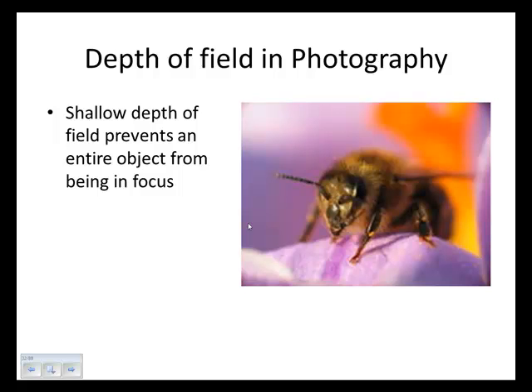Consider this little bee. Is he in focus? Yes or no? Both answers are correct, right? Part of his body is in focus, and part of his body is blurry, right? So, this is a close-up with a camera. The thickness of the focal plane of this image is how thick?